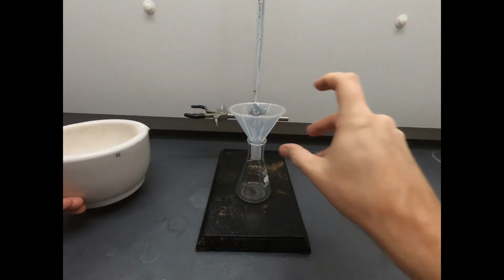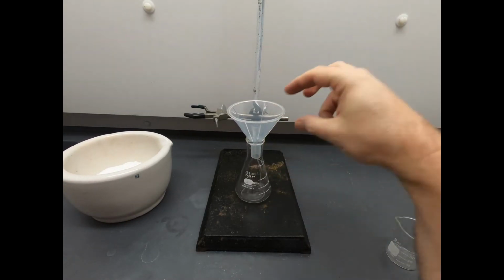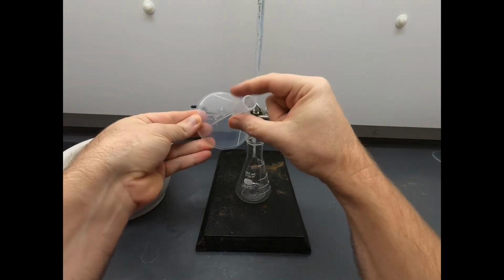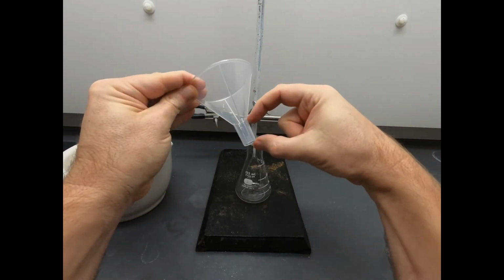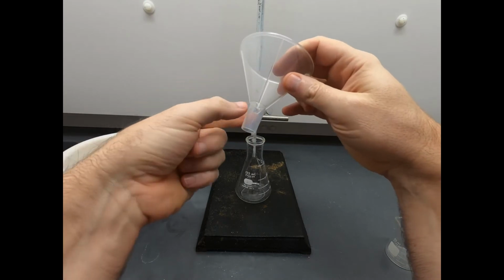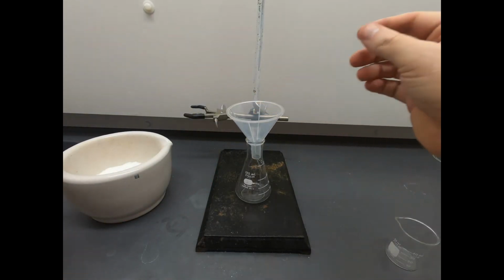So now we have a funnel on a flask. This funnel is a powder funnel. Powder funnels tend to have a wide opening in the stem, and a short stem as well. And that minimizes the chance you're going to plug up your funnel. So there are different types of funnels for different uses in a lab.